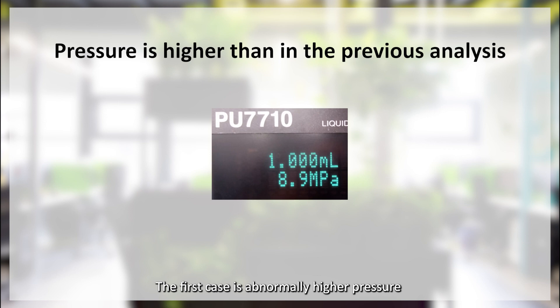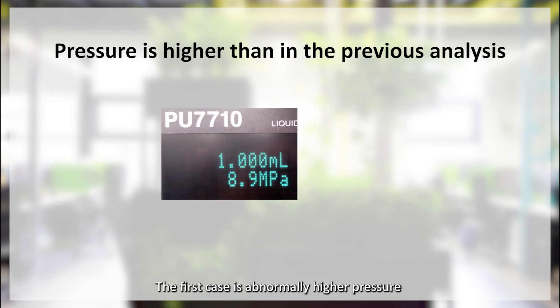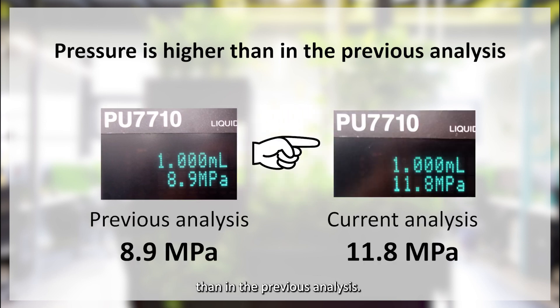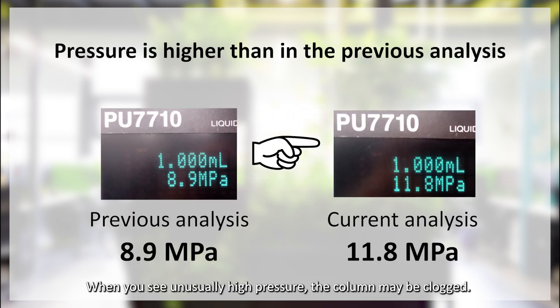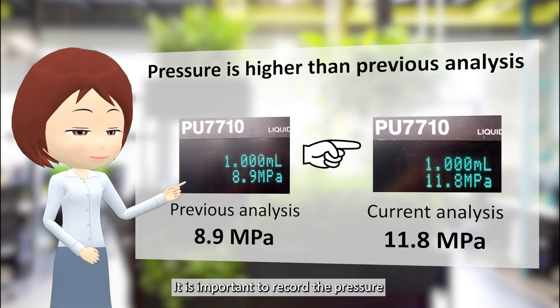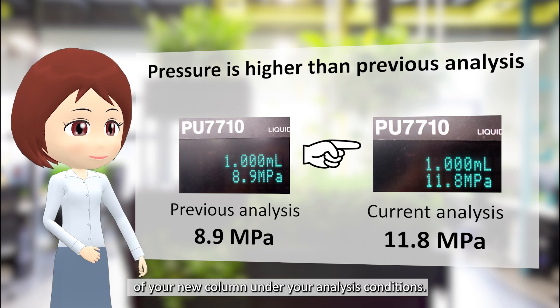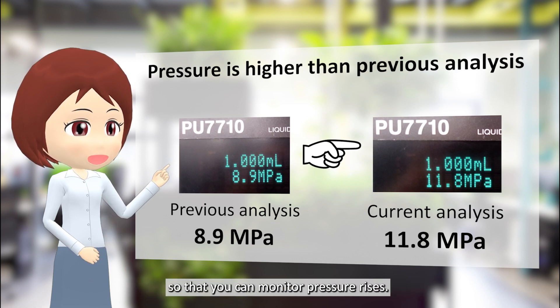The first case is abnormally higher pressure than in the previous analysis. When you see unusually high pressure, the column may be clogged. It is important to record the pressure of your new column under your analysis conditions so that you can monitor pressure rises.